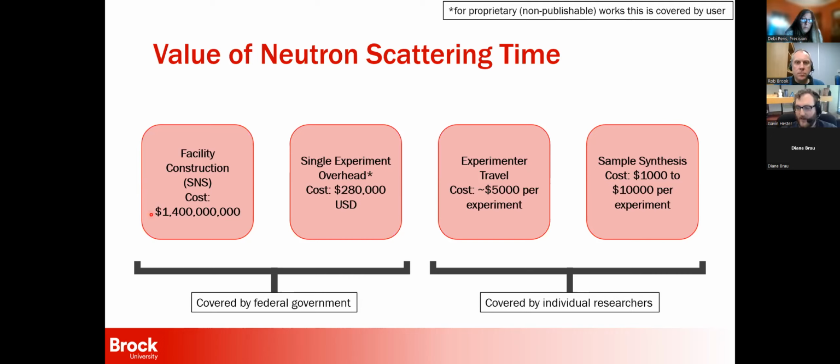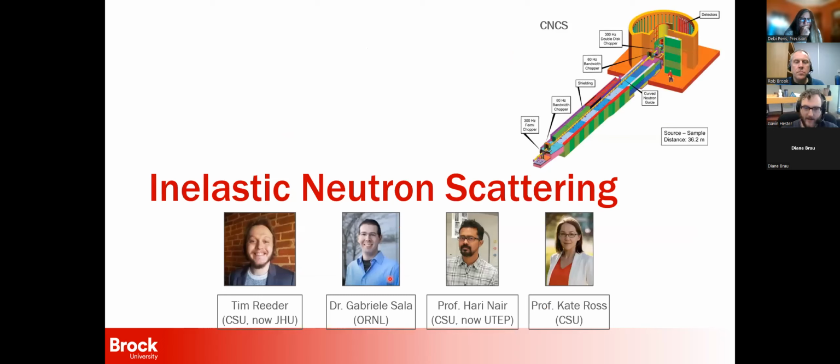And that's just on a materials basis, not even factoring in time and instrumentation that you would assume you already have. So $15,000 is a rough guess for how much it costs a neutron scatterer to do their experiment. And so with that, I want to go over to now talk about the data, and then we'll come back to a little bit talking more broadly about neutron scattering.